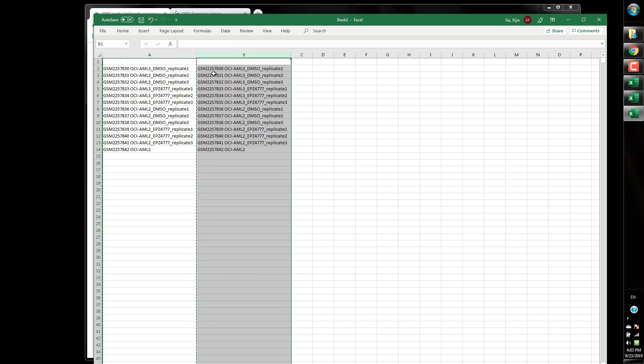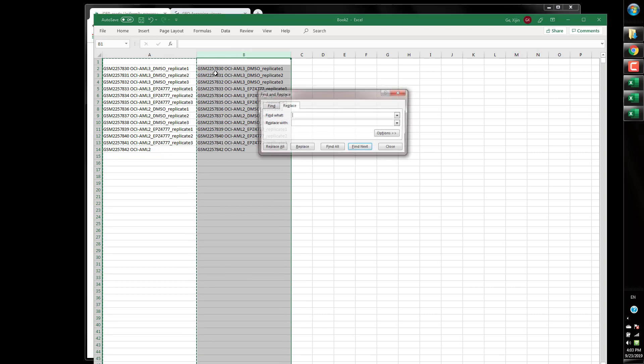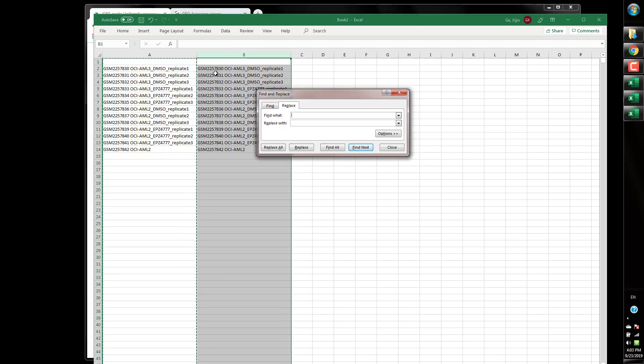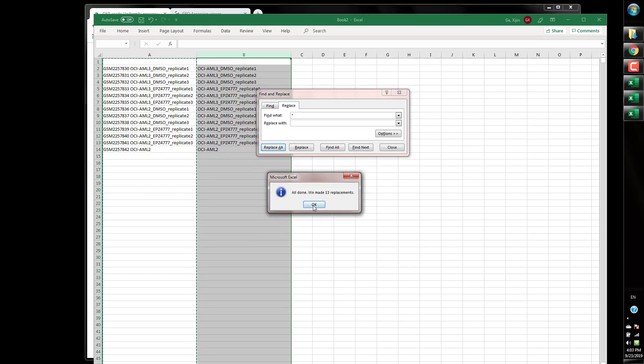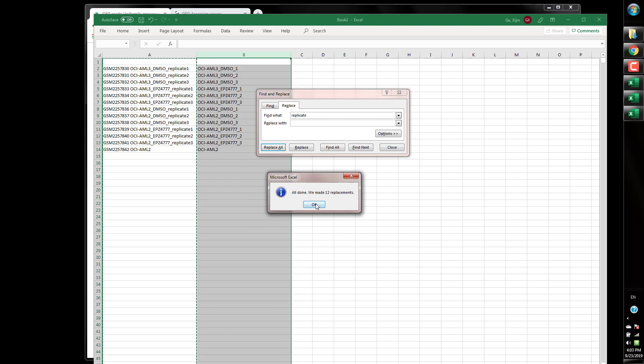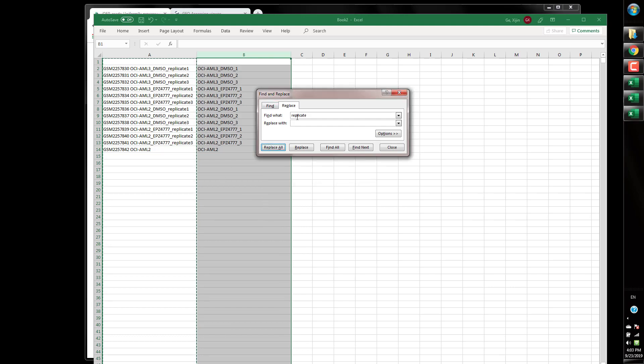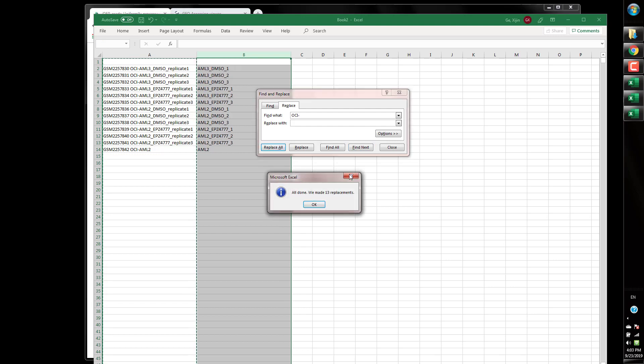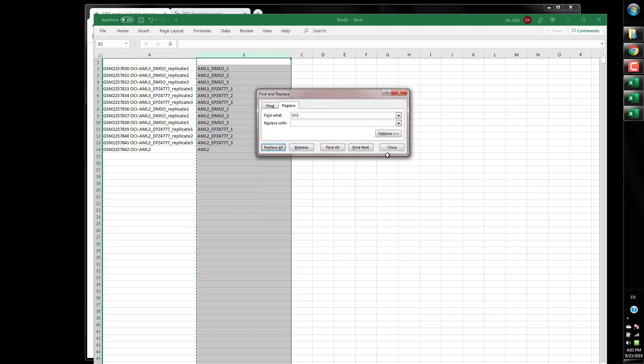First of all I don't need this accession number so we're going to replace that so anything before a space is replaced with nothing so that goes. I'm going to also replace this replicate in here because it's repetitive and we know they are replicated and OCI and this is gone.